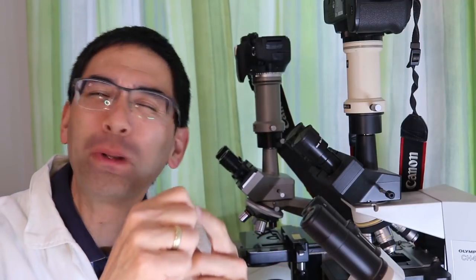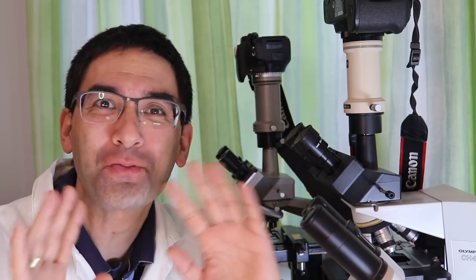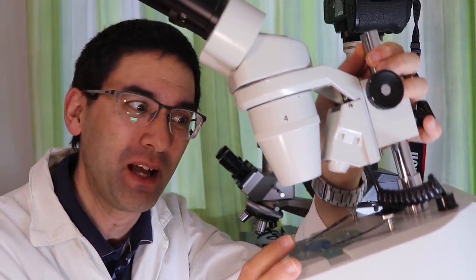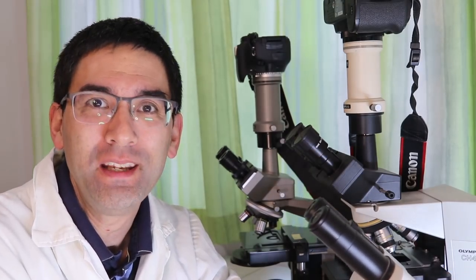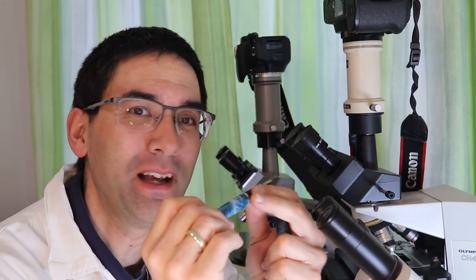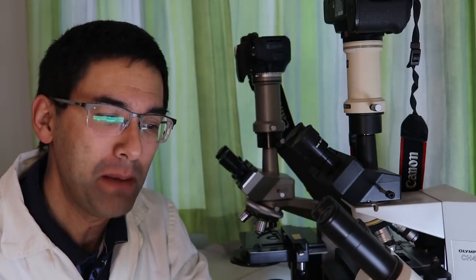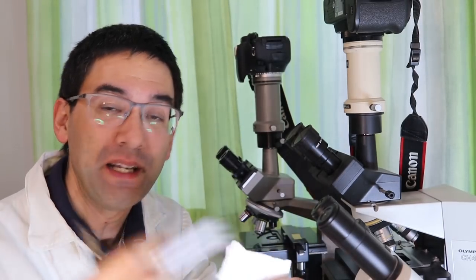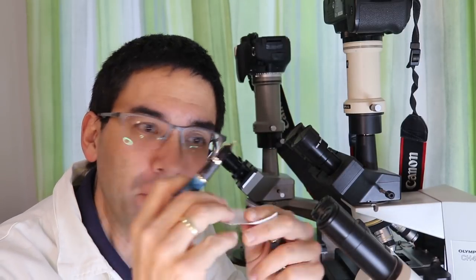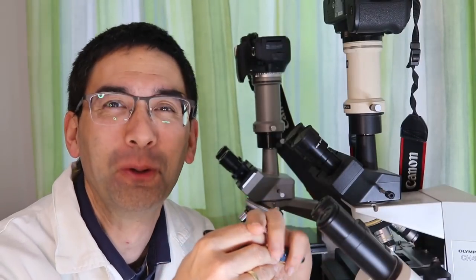Today we'll be doing a totally meaningless, pointless and irrelevant microscopy project, but one which is extremely fun. I spent hours behind my stereomicroscope, that's the one that I'll be using today, and I've been observing, yes, a fountain pen, okay? There is ink in here, and this ink is soaked up by various types of paper. So I got some tissue paper here, toilet paper, writing paper, newspaper, all different types of paper. And what I did is the following. I used this pen to write on these different types of paper, and I looked under the microscope, and this looked pretty cool. So let's get started.